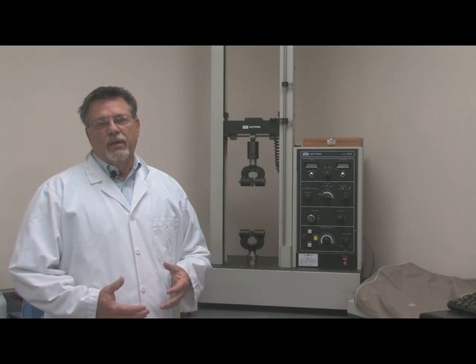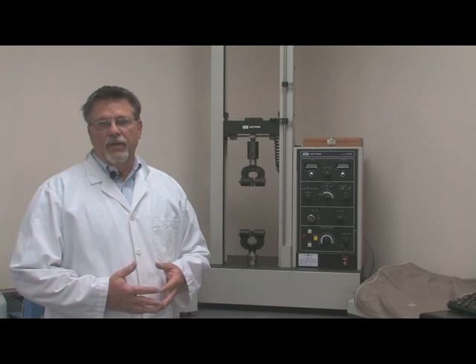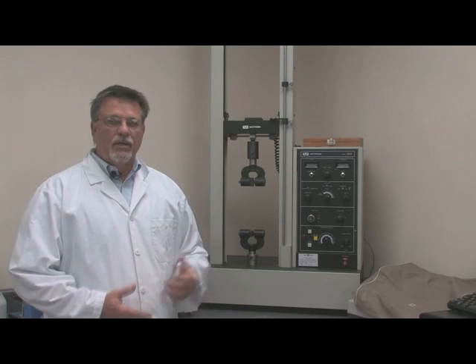We have here in the corner the Beast. This is our Instron. It's basically the same device as our Tinius-Olsen. This particular unit is one that we use to do some special qualification of things like films. We're doing pull testing when we do adhesive development, for instance, and we want to check for the pull strength of an adhesive with different substrates.